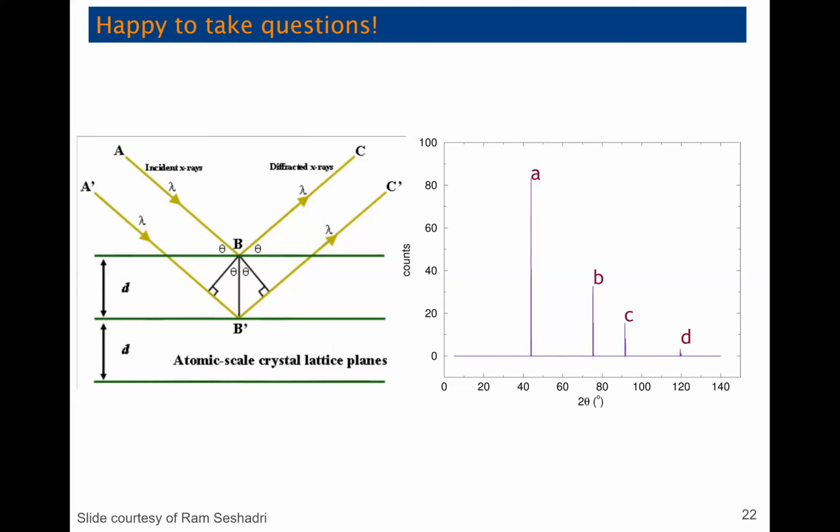I have a quick question. I know that you're talking about how typically we use a lot of powder XRD. Would it be possible, hypothetically, if we made something into a pellet, could you take the XRD of the pellet, or get a scan of that, or would we have to make that into a powder and then take the XRD of that? What would be the difference between the two?